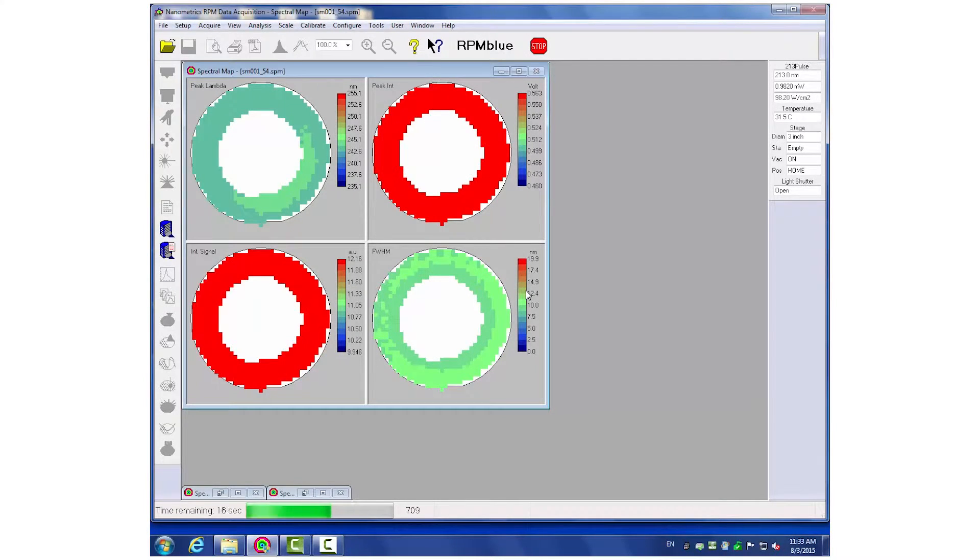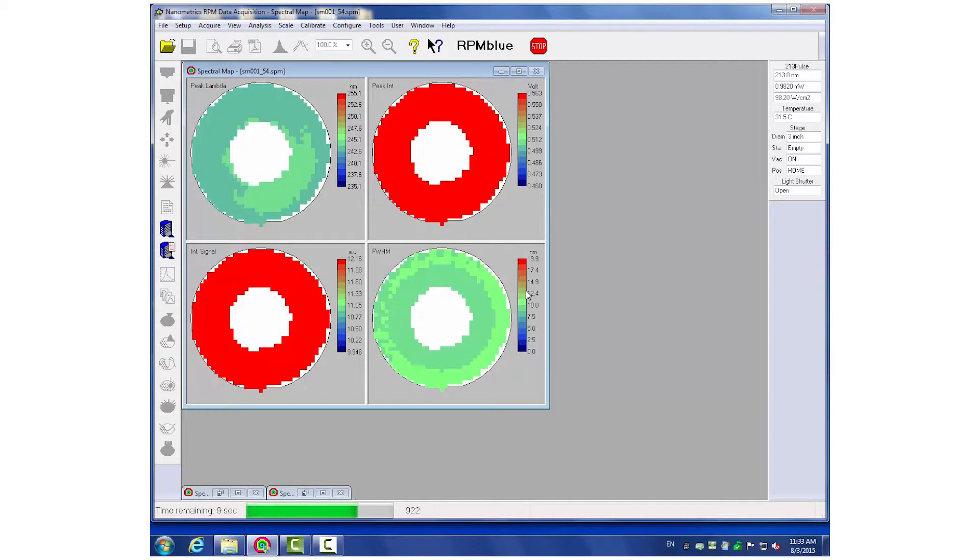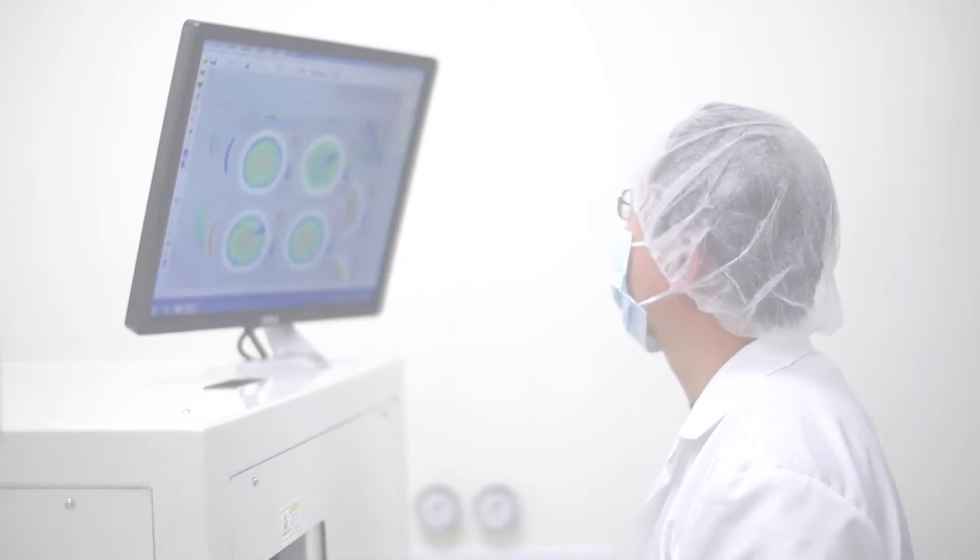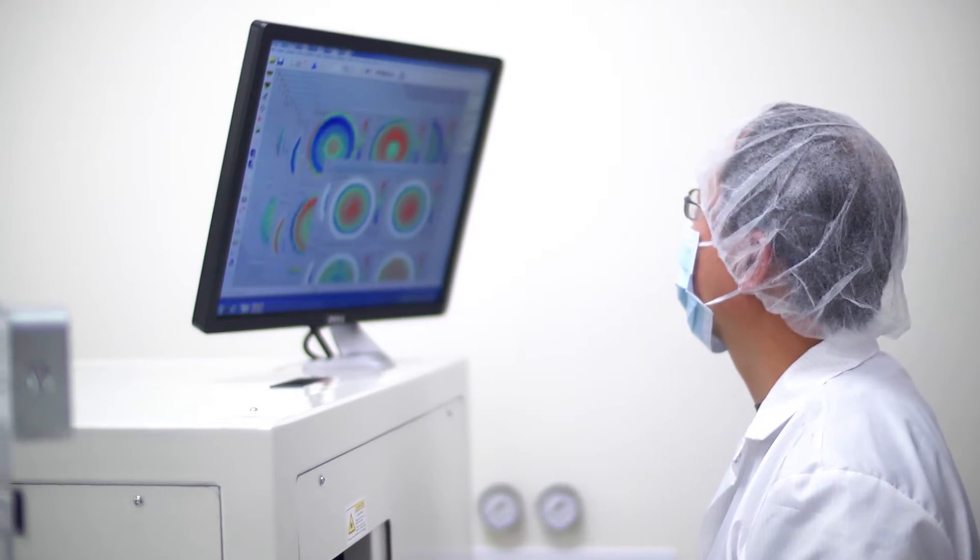This version of the RPM Blue has been specifically designed to meet the needs of LED manufacturers regarding performance and cost.